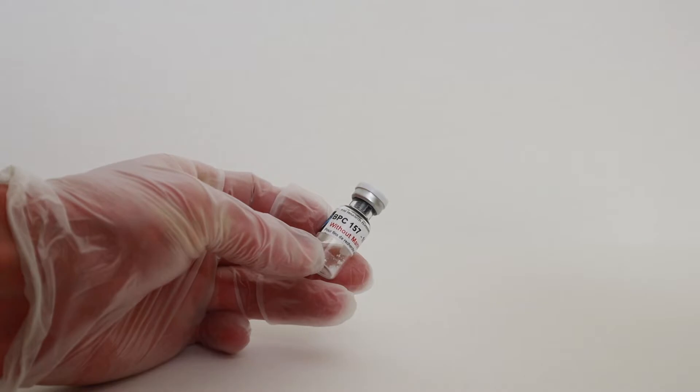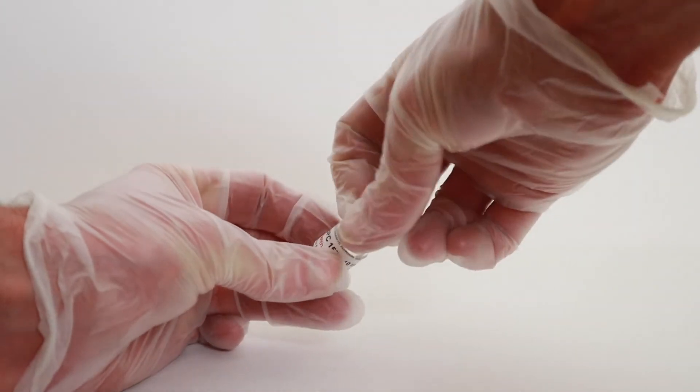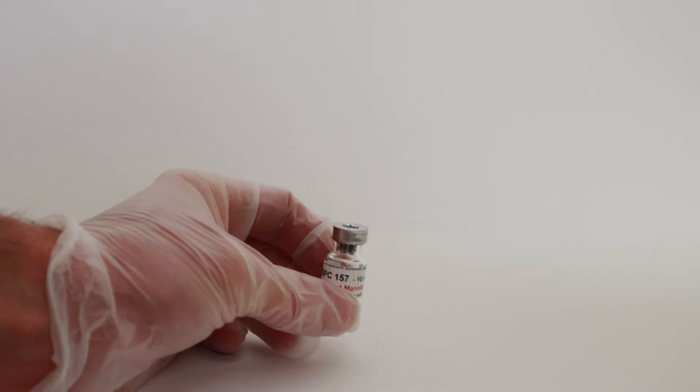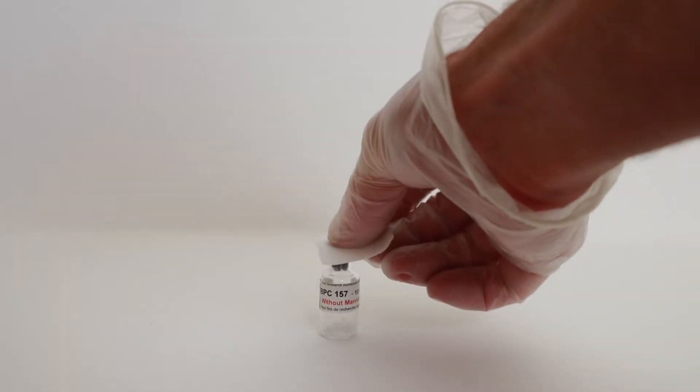Take the peptide and remove the cap from the top, set it down, and swab it with alcohol.